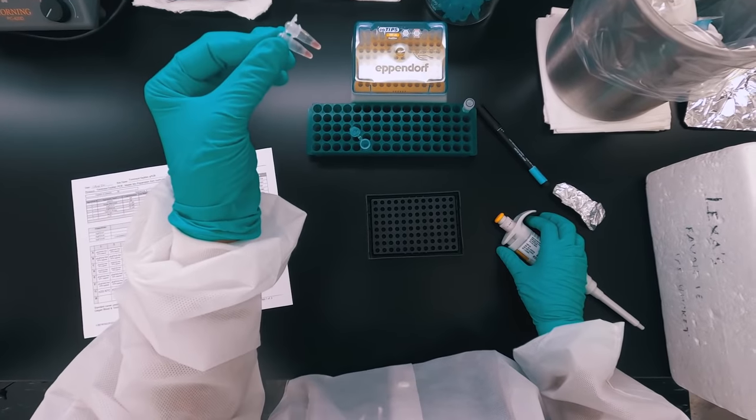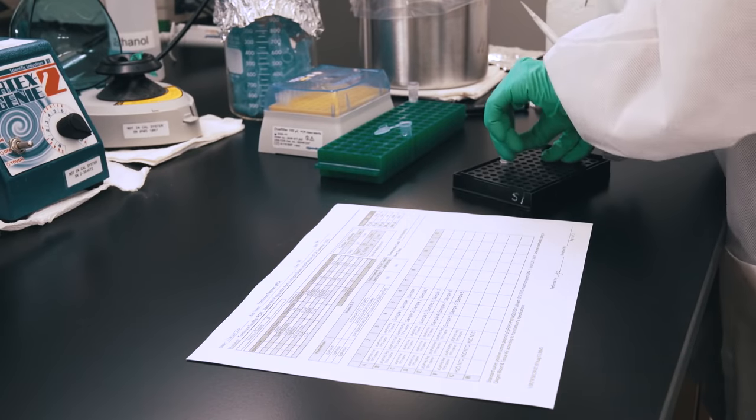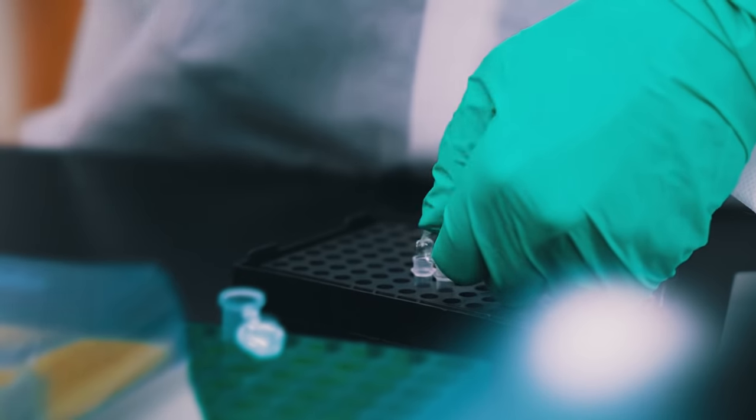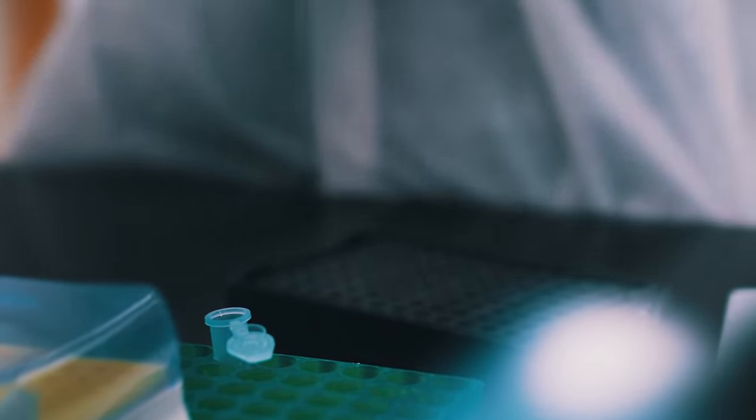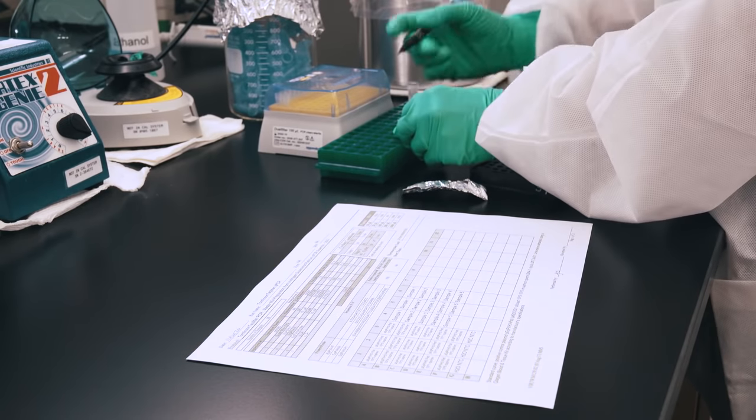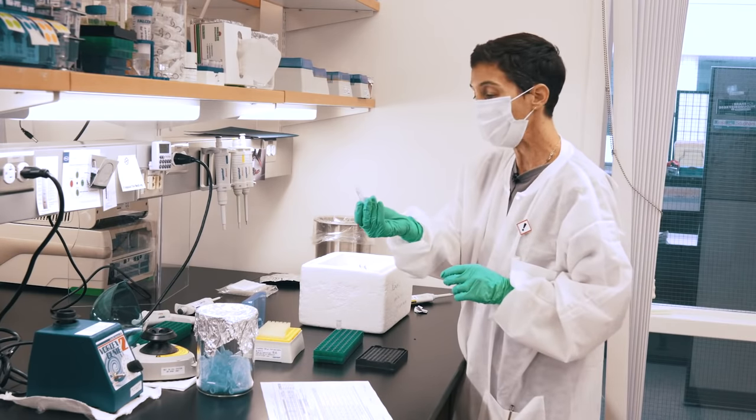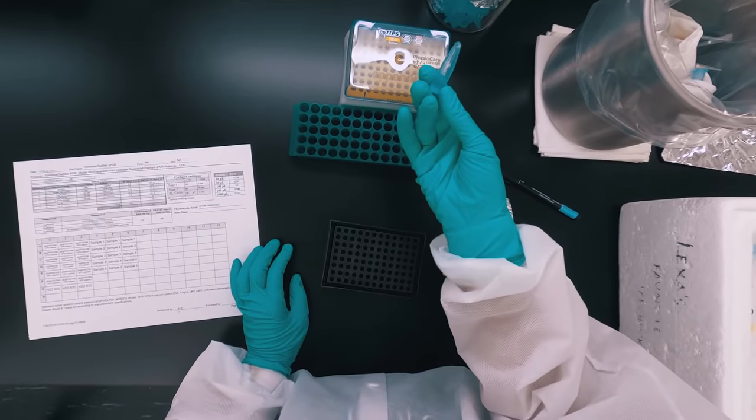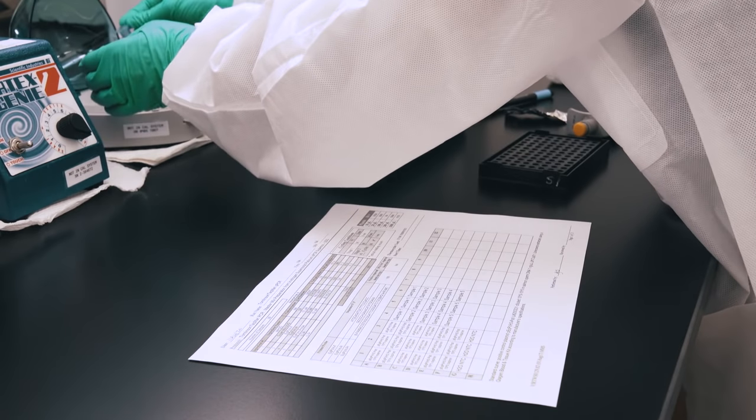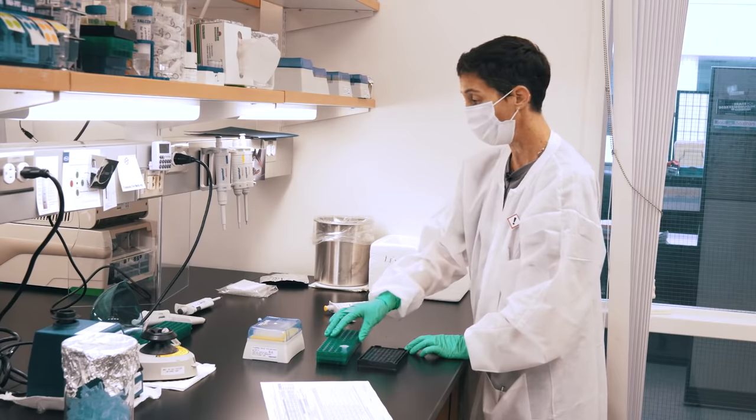The probe we aliquot into 50 microliter volumes. We also do a dilution down to the required concentration as our very first step after we've received the primer from the manufacturer. We then dispense into very small tubes, which we can then break apart, and we only freeze-thaw this the one time. So we receive it from the manufacturer, we add buffer to get it to the correct concentration for our reactions, dispense it into small volumes, and then freeze it. And then when we use it, since it's already been freeze-thawed once, we'll throw it away. Another thing to know about the probe is that it is light sensitive. So when you pull it out of the freezer to thaw it, it's a good idea to wrap it in foil while you're letting it thaw. Also while you're setting up your reaction, you want to protect it from light. That does not mean that you need to do your reactions in the dark. Some people think you do, and it's very hard to pipette correctly in the dark. It just means to not dilly-dally while you're setting up your reactions. I don't like to vortex my master mix. I don't think that vortexing is good for enzymes. So I will invert the tube a few times and then give it a spin to get any liquid off of the lid. And at this point, we're ready to dispense the master mix into the PCR plate.